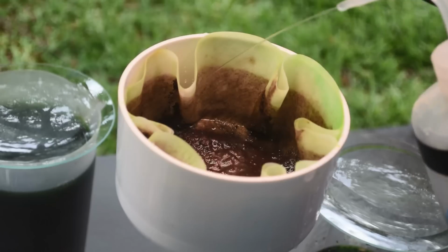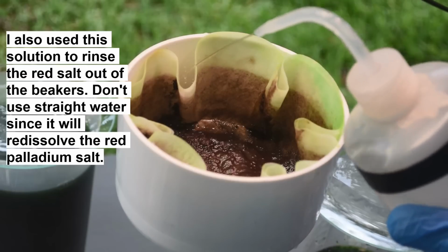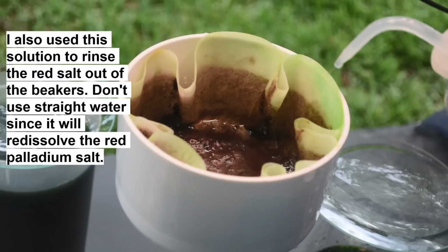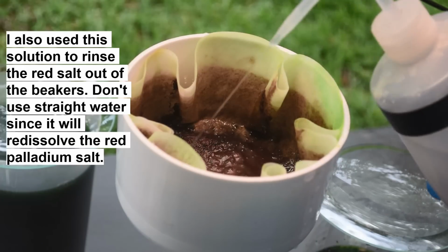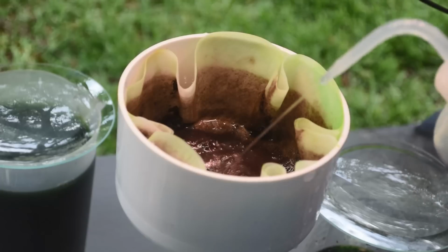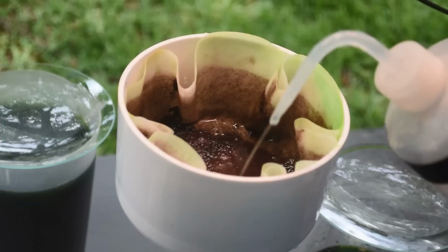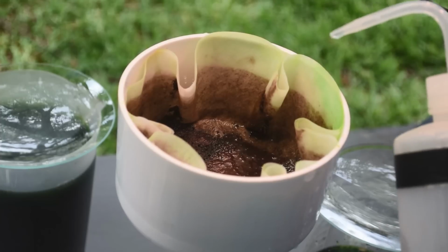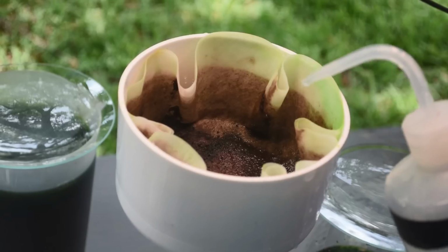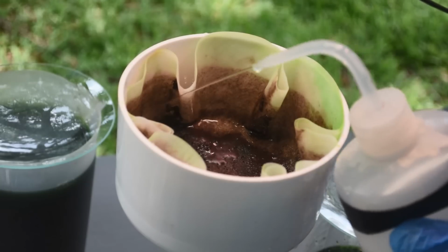All right, I am using a saturated solution of ammonium chloride in water to rinse down this filter, trying to get as much of the copper color out of it as I can. Just clean up the palladium salt here. Using the ammonium chloride solution will prevent the palladium from going back into solution. You don't want to use water here. Use a saturated solution of ammonium chloride in water.